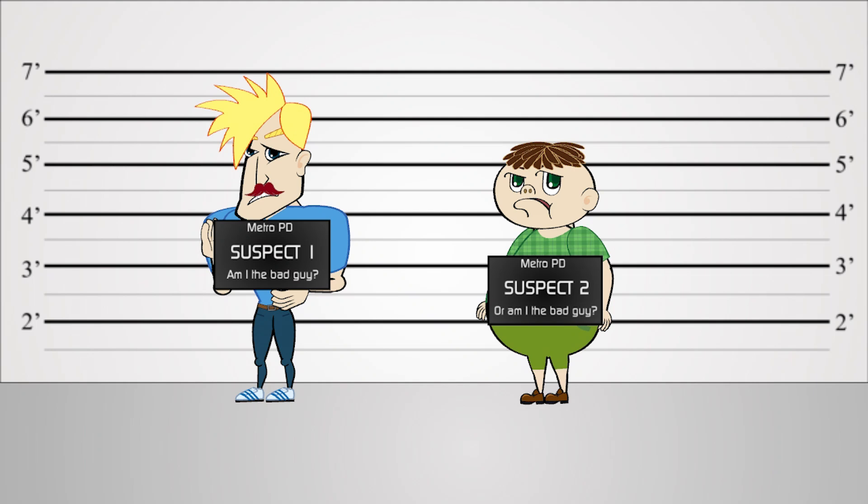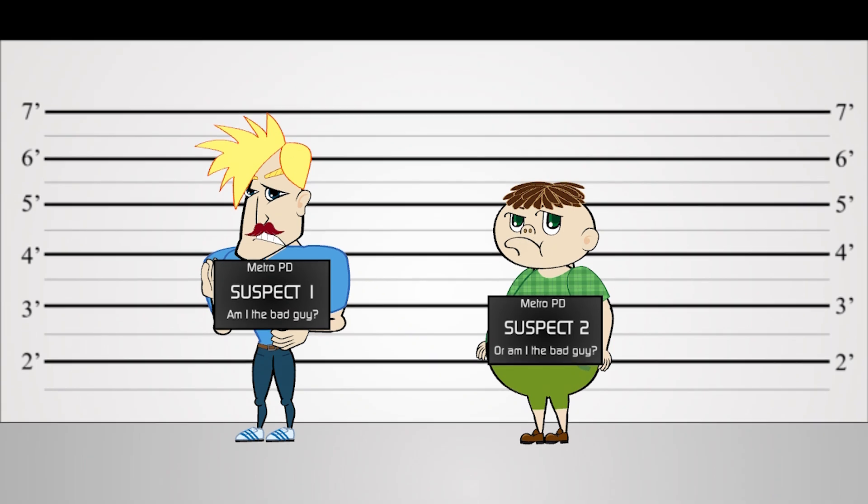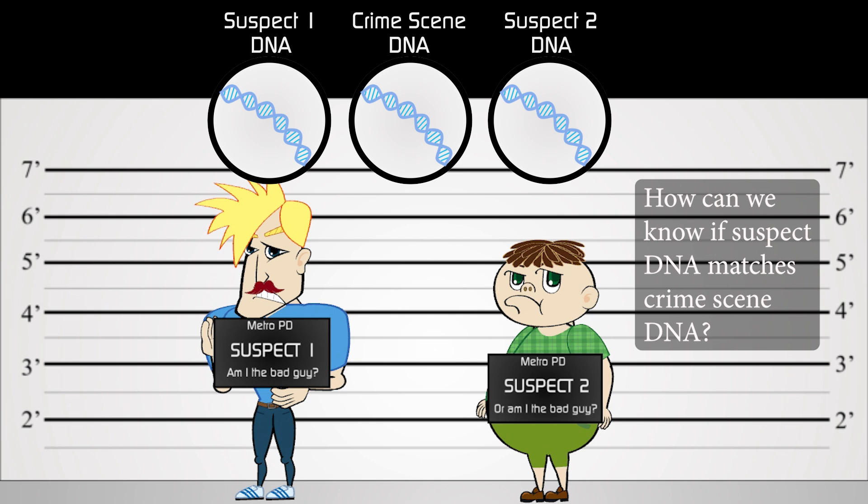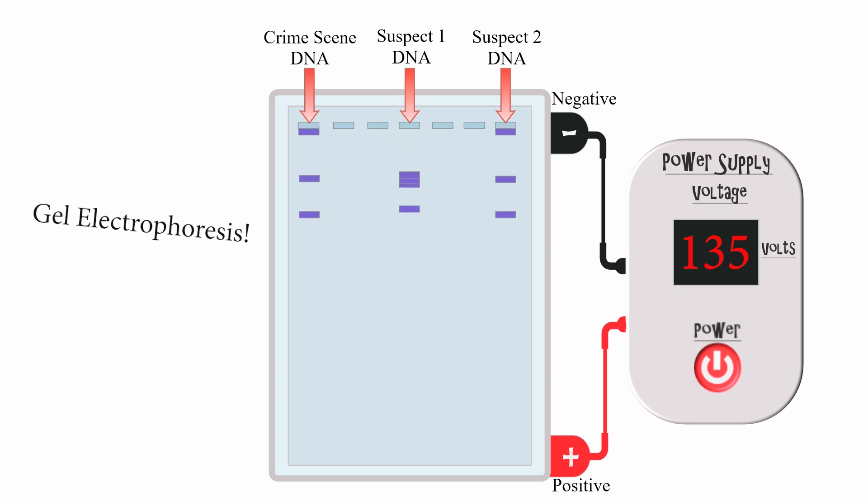Have you ever wondered how scientists are able to match DNA from a crime suspect to DNA found at a crime scene? One of the main techniques that makes this possible is gel electrophoresis.